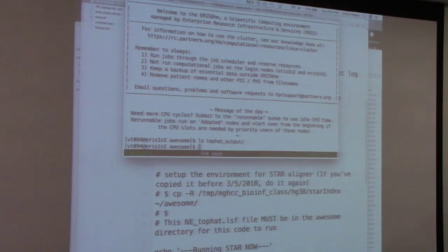We have some file. Right, so you should be able to find that. Yes, files. Oh, you're using files a lot. I was trying to do it through text. Are you running it on your phone instead? Why are you copying and pasting this?